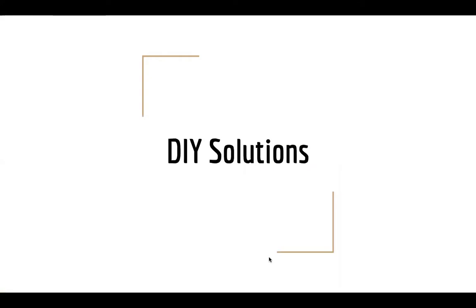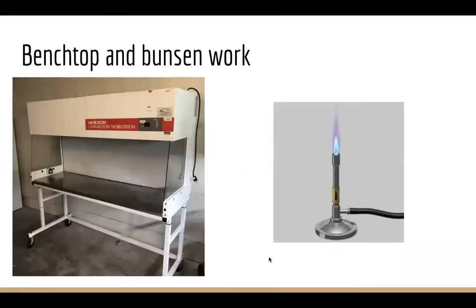So let's look at DIY solutions. To be in this sort of environment where you can work with microbes, you've got to make sure that you don't have contamination. Microbes that are floating in the air are very, very light. Because they're floating in the air and going through the atmosphere, you have to have a way of creating an area where they're taken out of the atmosphere or kept away from your plates.